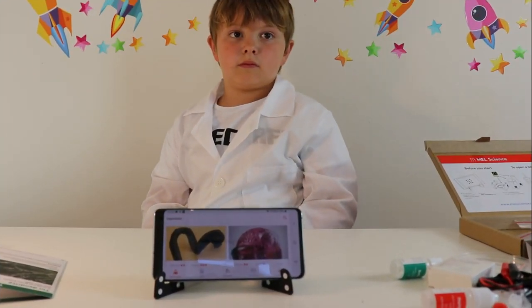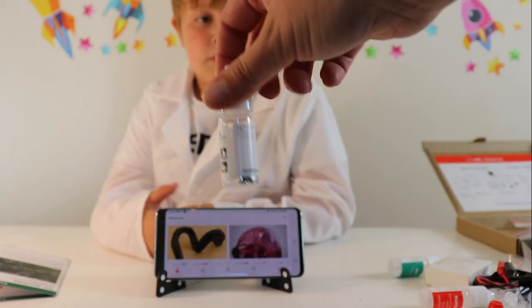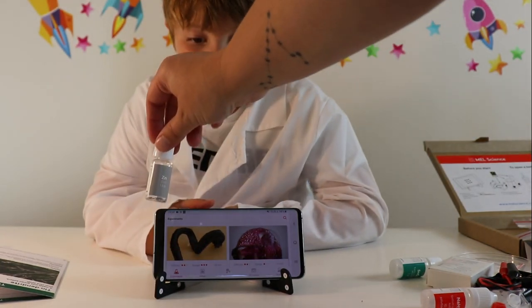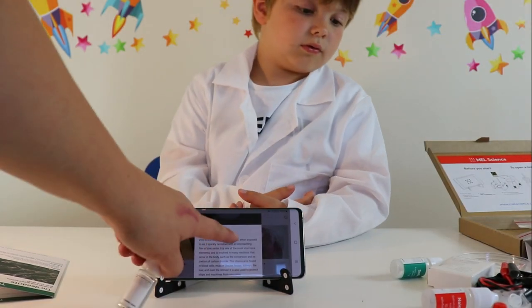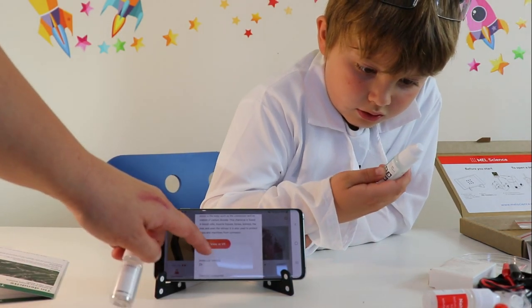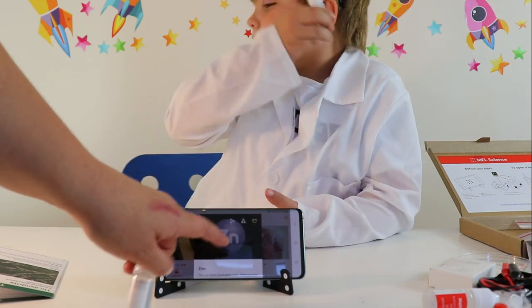Just before we start, I wanted to show you something really cool. Each chemical bottle that you get — this one is zinc — comes with a code. If I wave that in front of my phone camera, it'll come up with the chemical and tell you all about zinc. And then it will say 'view in VR', so you can use your VR headset to view it. How cool is that?